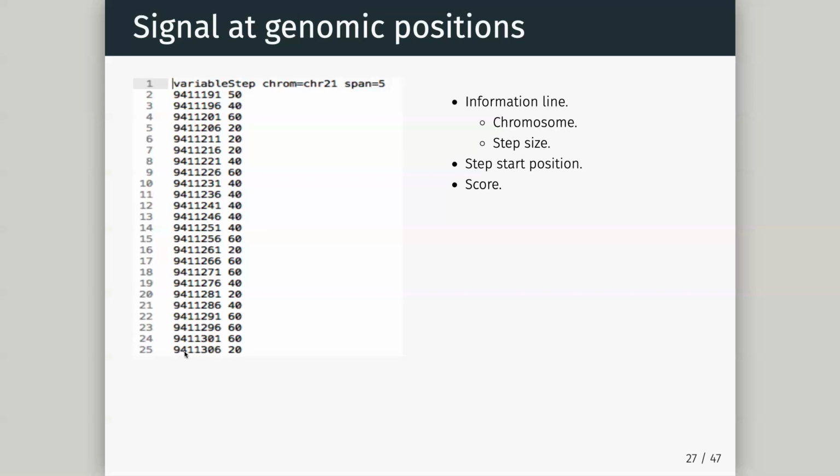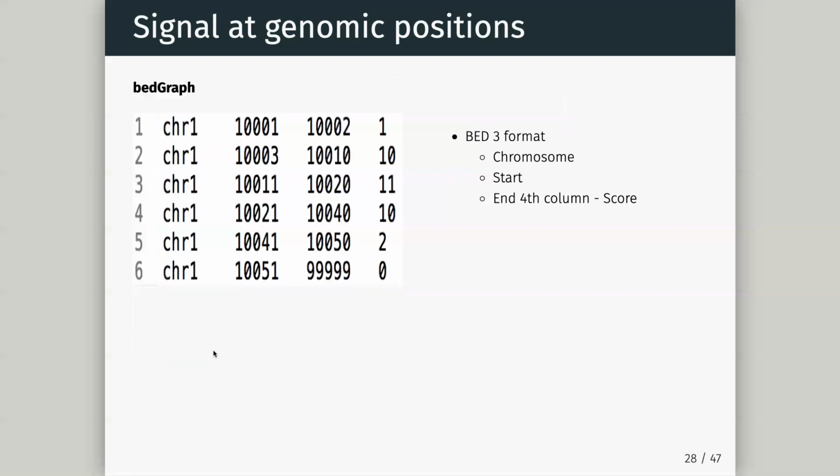So knowing we're at 9,411,306, it's going to be a big file, right, stepping it through.